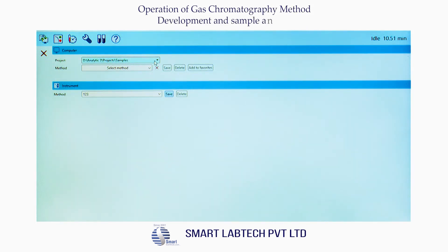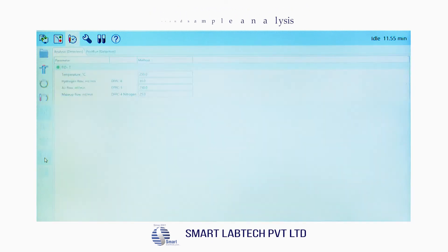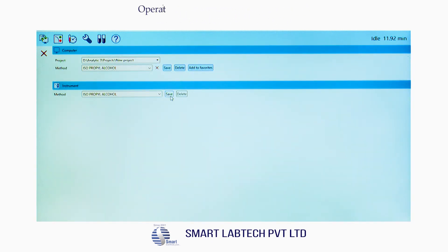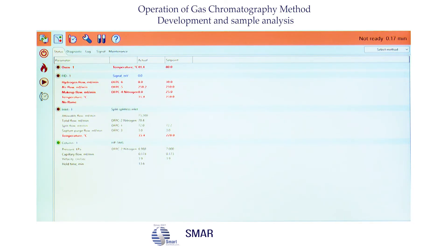The computer screen appears. Select the project as New Project. Against method, type 'Isopropyl Alcohol', then click Save. Again save under the instrument — type 'Isopropyl Alcohol Method' then click Save. When you click Yes on Apply Mode, the method is transferred from the PC to the GC.